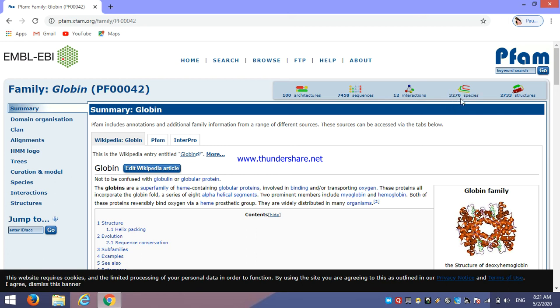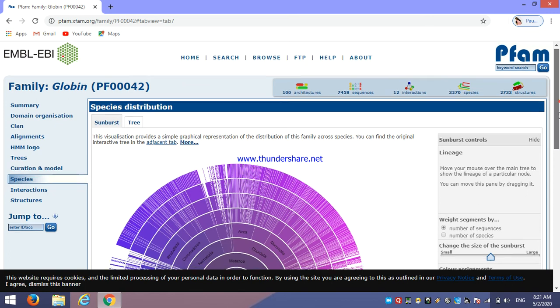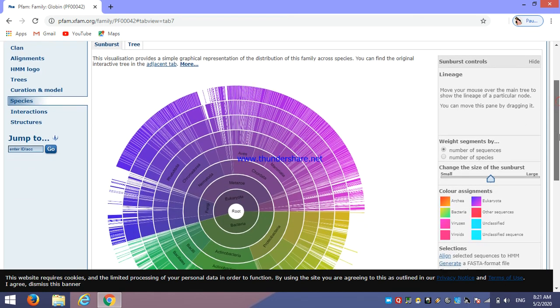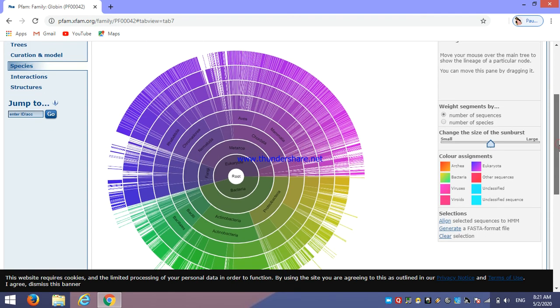So in this session we will study that this protein is particularly present in how many species. This is our PFAM results.